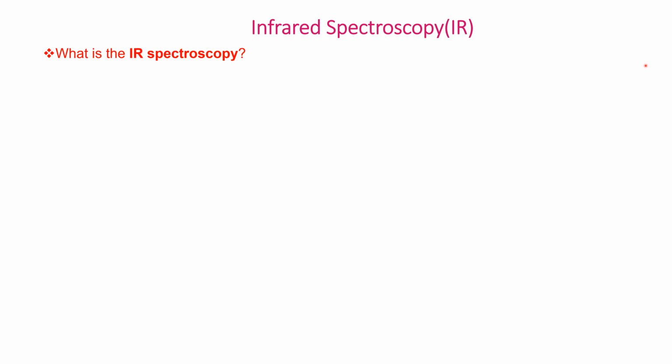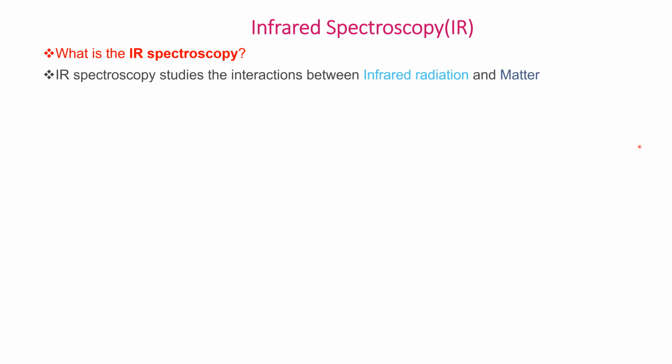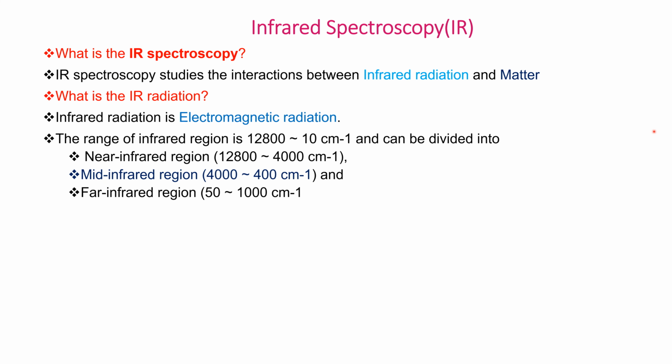Now, the question is: what is IR spectroscopy? IR spectroscopy studies the interactions between infrared radiation and matter. What is IR radiation?